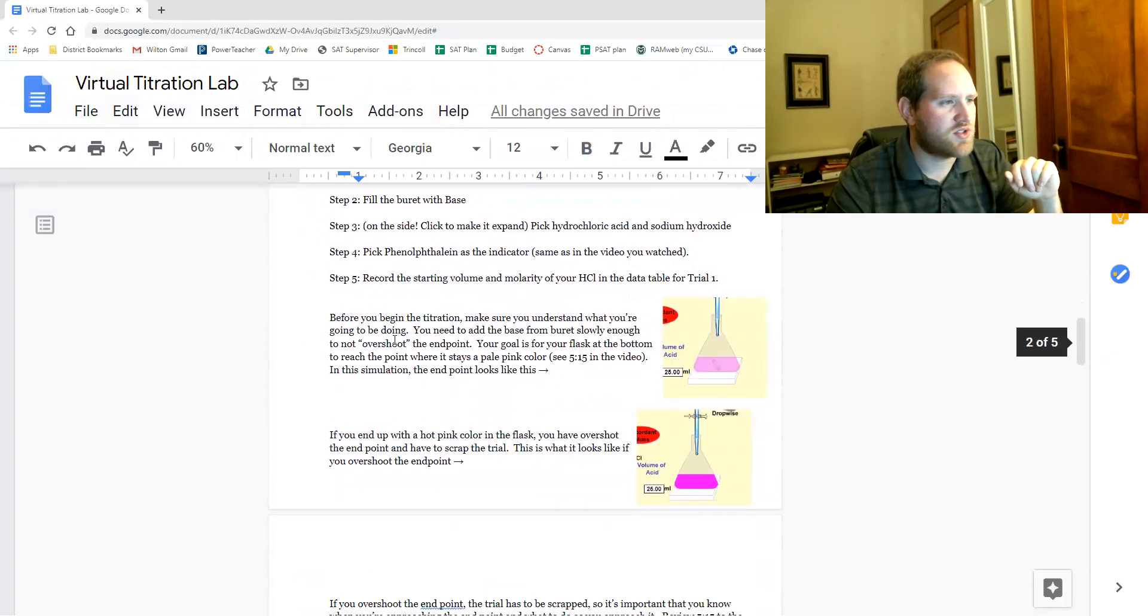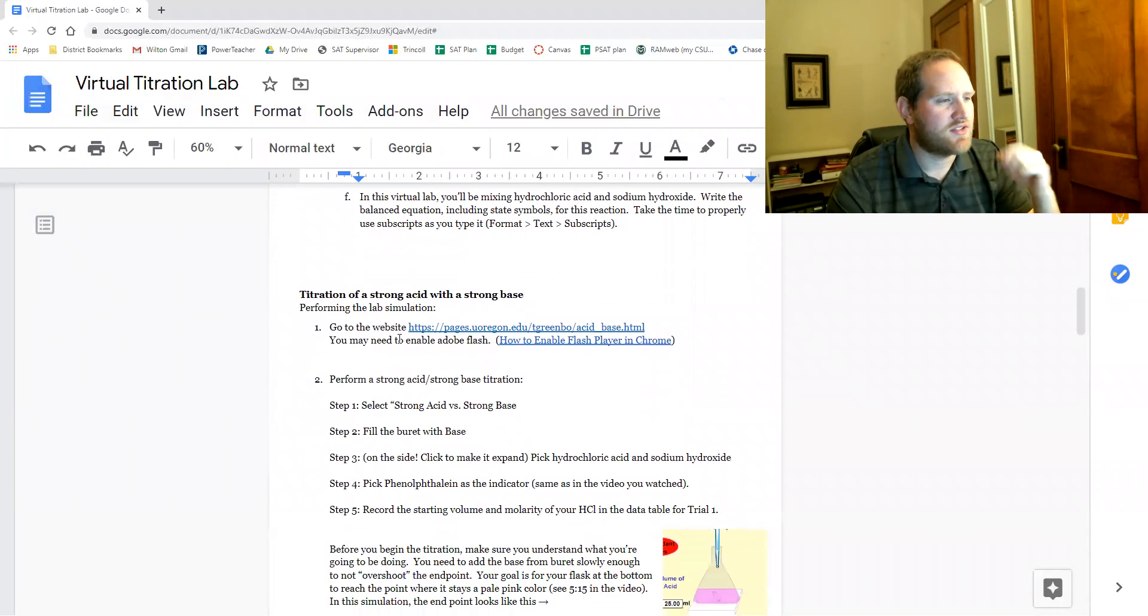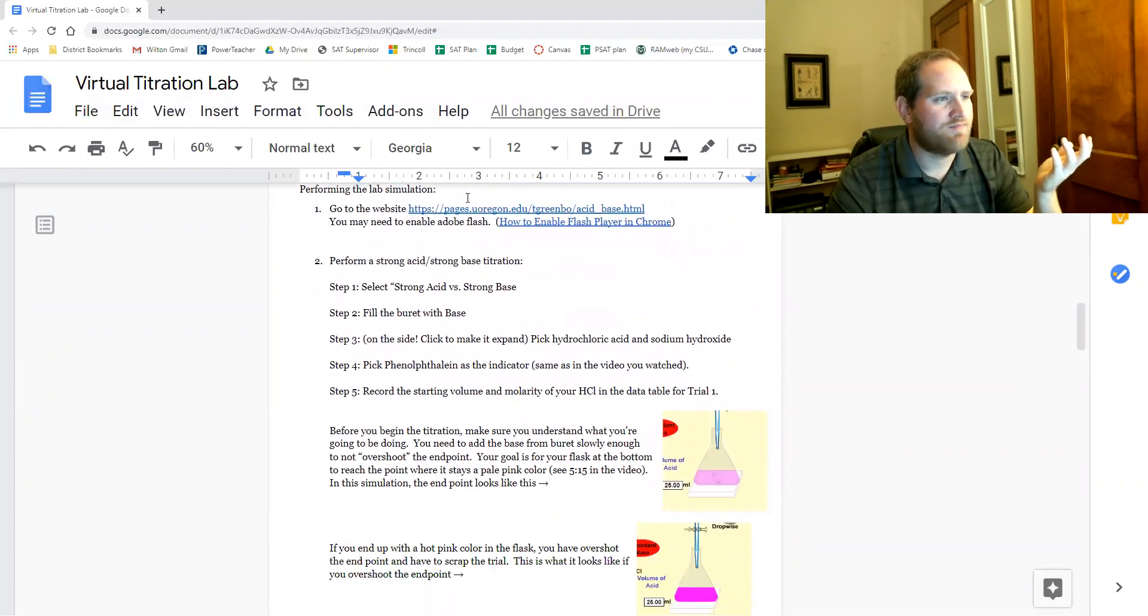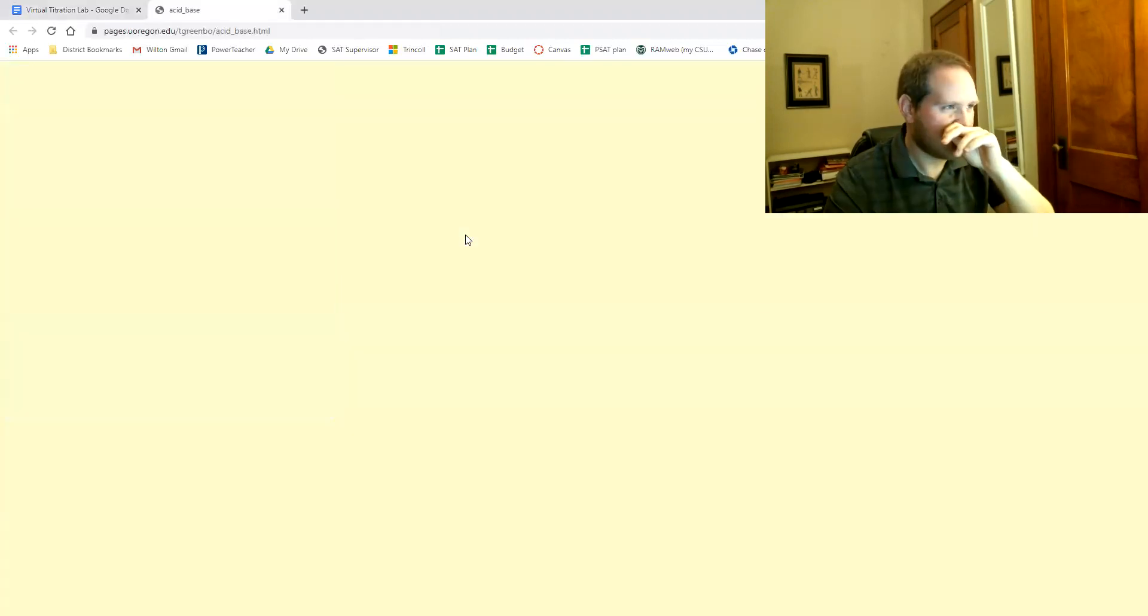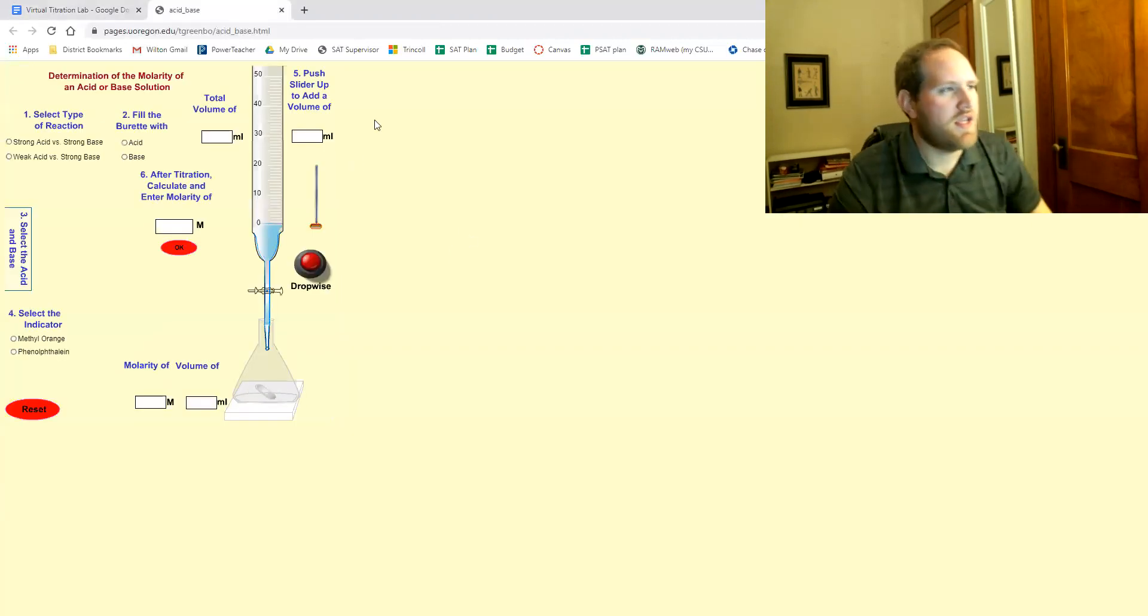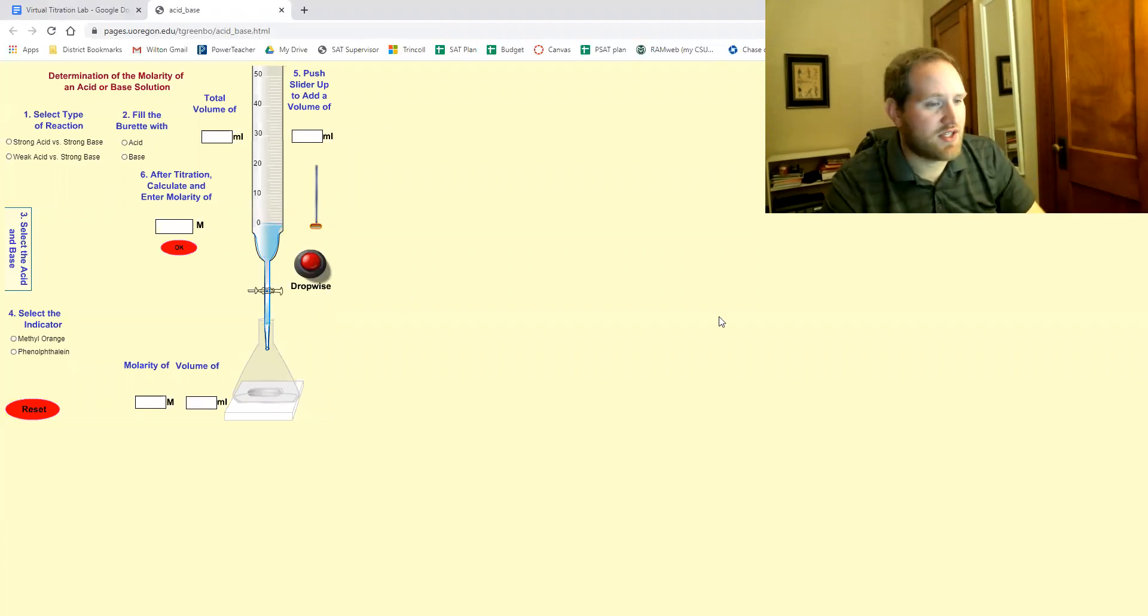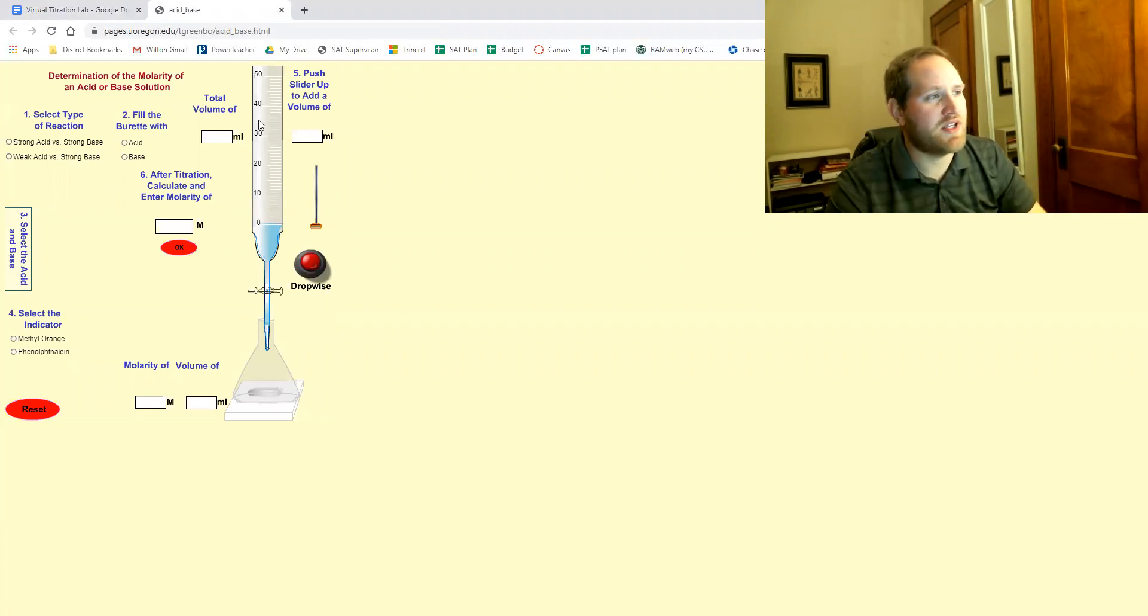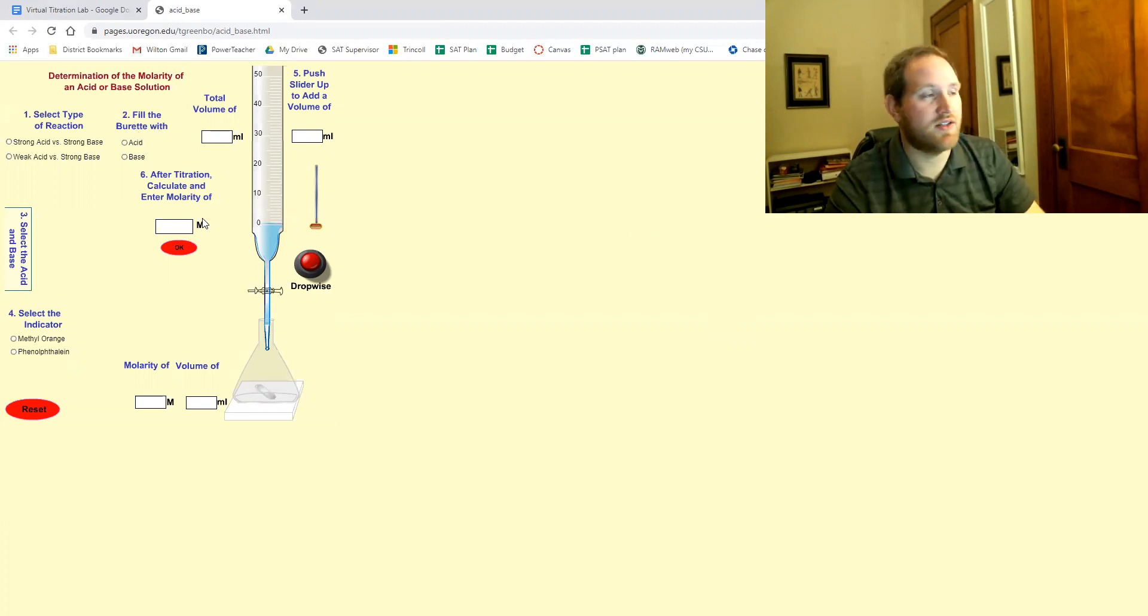So once the pre-lab questions are done, here's where you're actually starting the lab. So you click here and hopefully it'll open right up for you just like this. The first time you try opening it, it might say click to enable flash where you literally just click and it'll enable it.